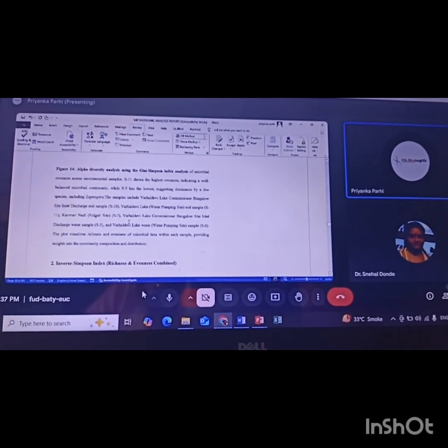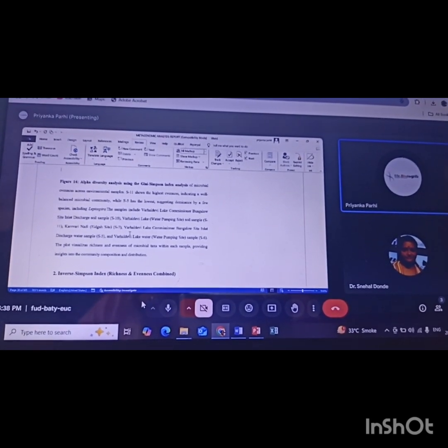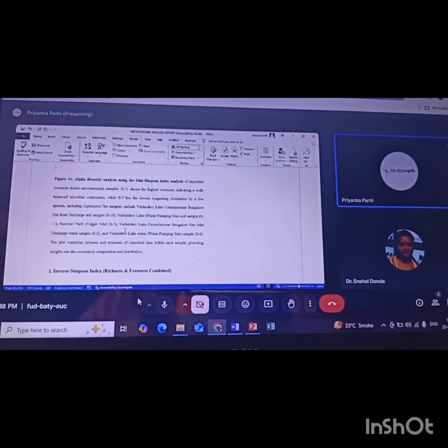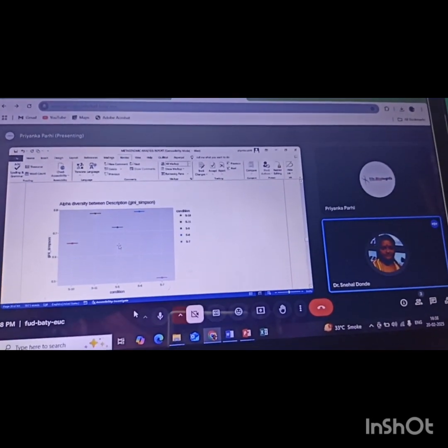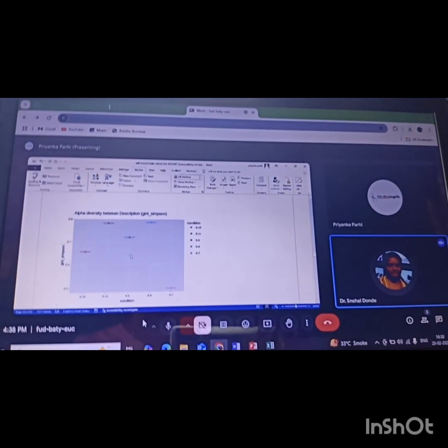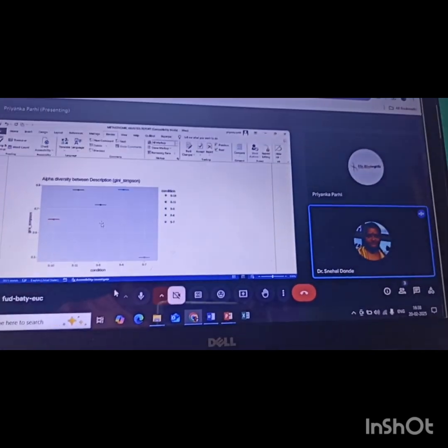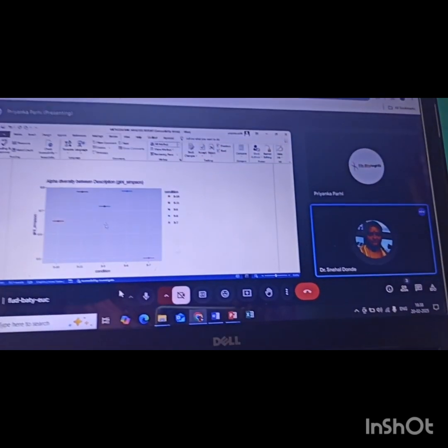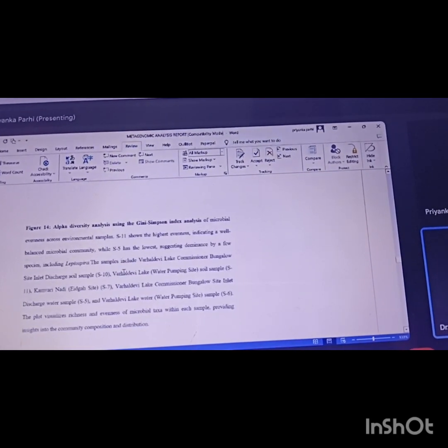The thing is, the amount of data is very big, and the analysis is not done by me. I'm just a person explaining all the data because I know this. But when we claim that it is richness or evenness, I have to know on what basis I'm saying that. Of course with the plot it is seen, but maybe the plot is near to the axis or far from the axis; how do I interpret it in that manner? Here we cannot see the axis also. It's shifted to the left-hand side, on one side only.